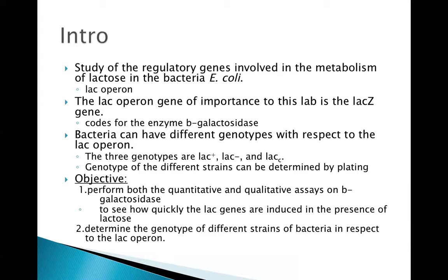The lac operon gene of importance for this lab is LAC-Z, which codes for the enzyme beta-galactosidase.